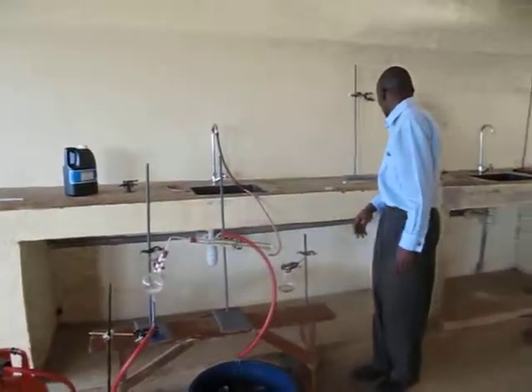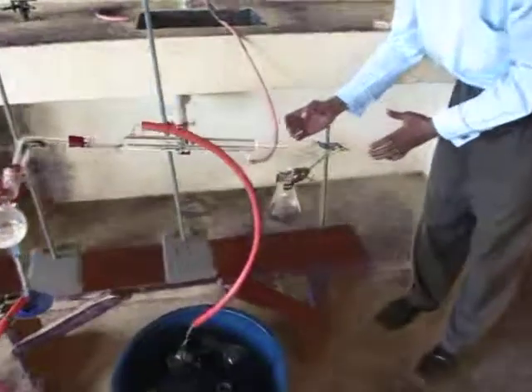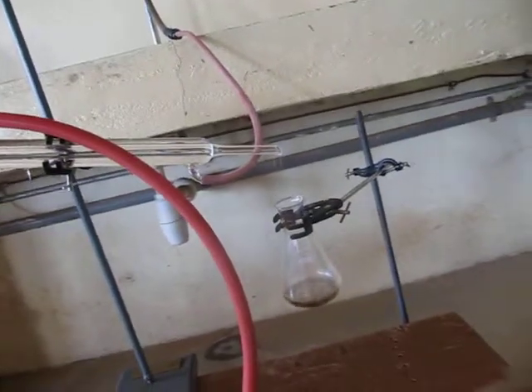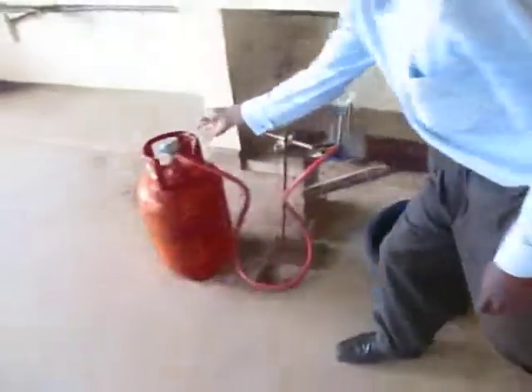And by that time, you are supposed to be changing the apparatus so that you prepare yourself to collect the second distillate. So that is basically what we have for distillation.